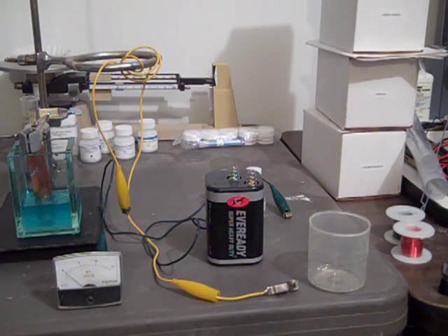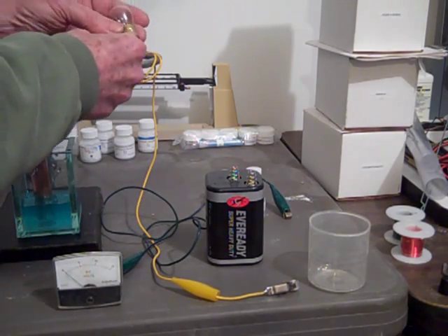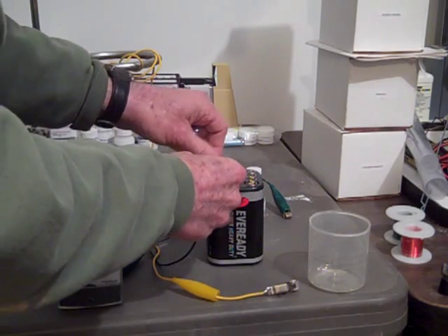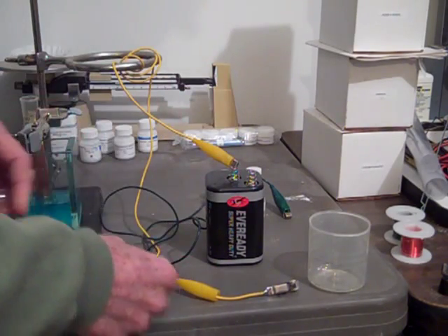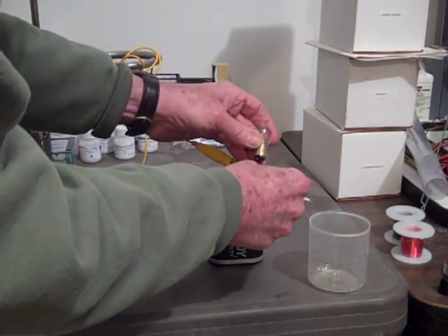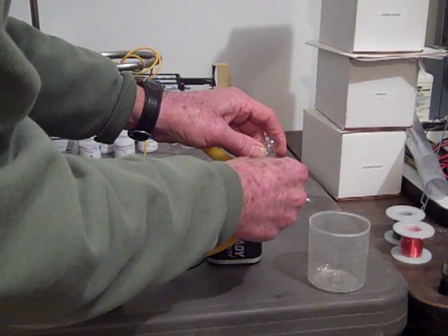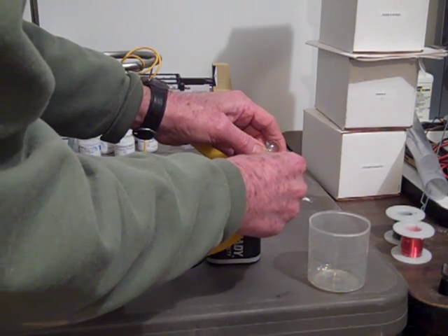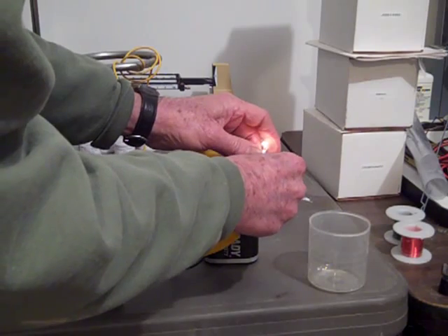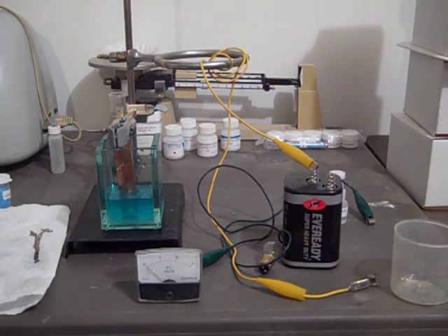I think we blew our meter, so we're going to check this with a light bulb — let's see if we can get it to light. Yeah, we've got good power through there. We hit the milliammeter with too much current and blew out a fuse probably. There's plenty of current in there. So that'll be our experiment — that's it.